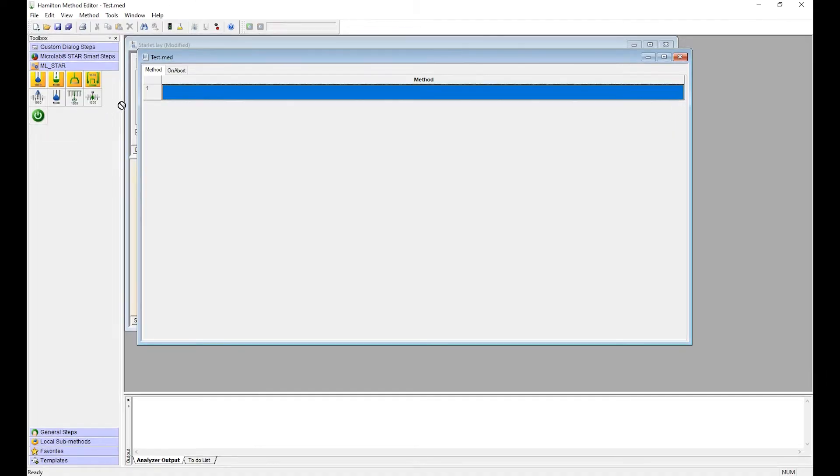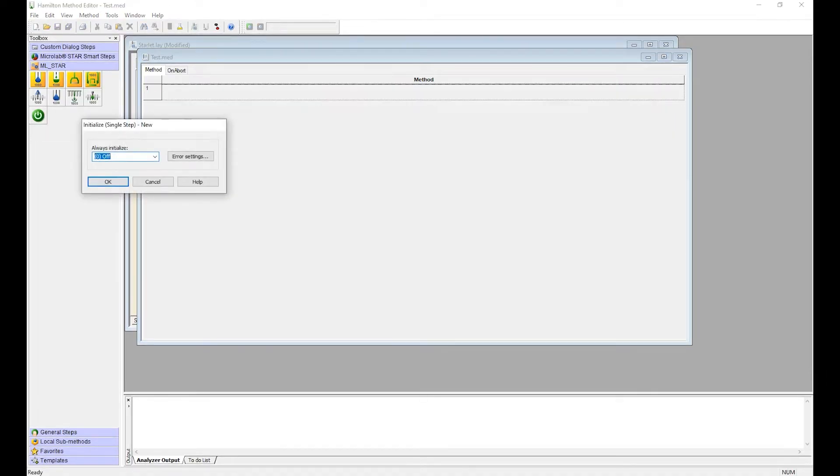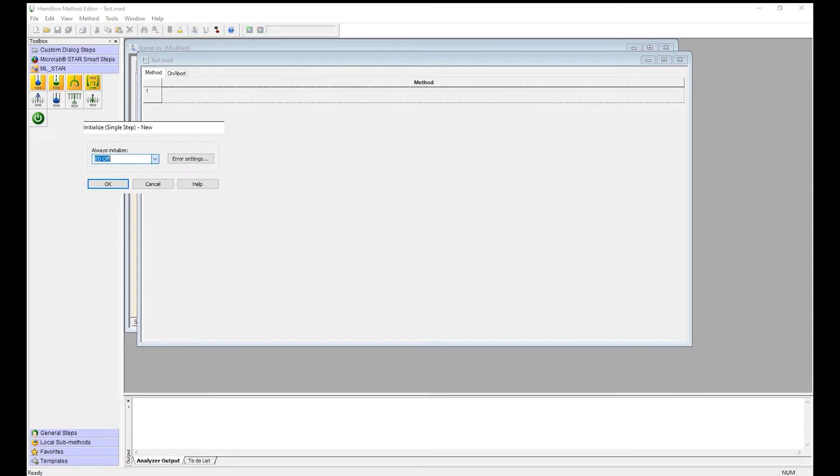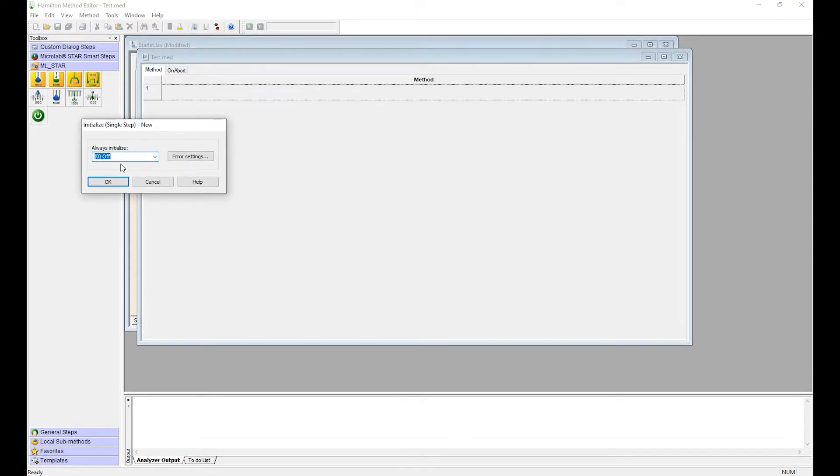First we're going to add our initialize step to the method. If you want to initialize it every time at the beginning of the method select on for this one, but most of the time you just use off.